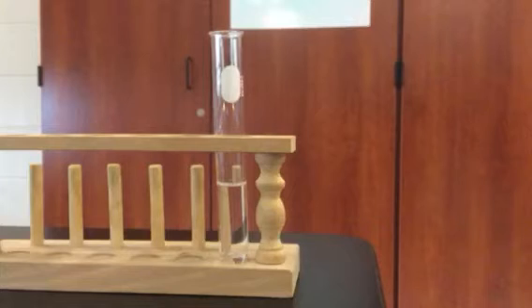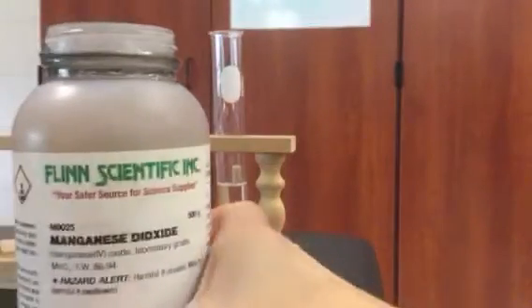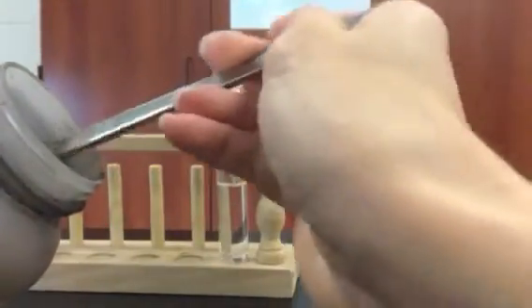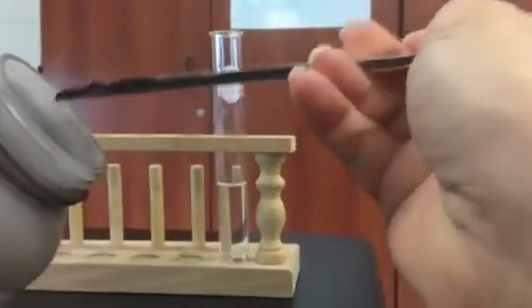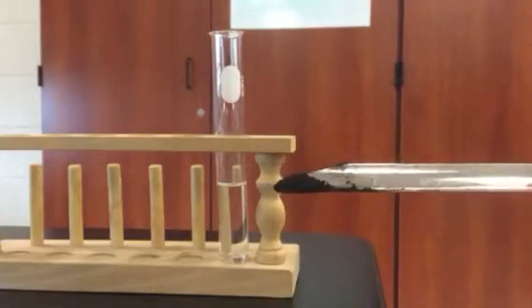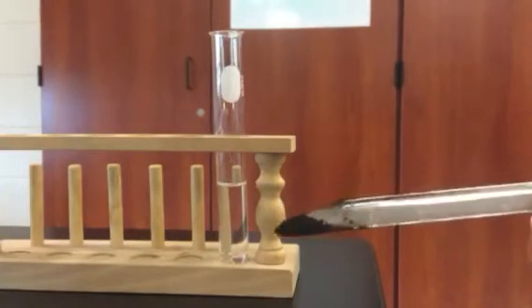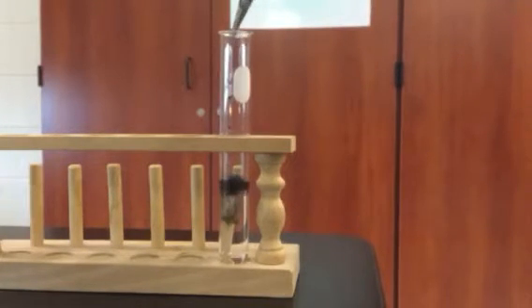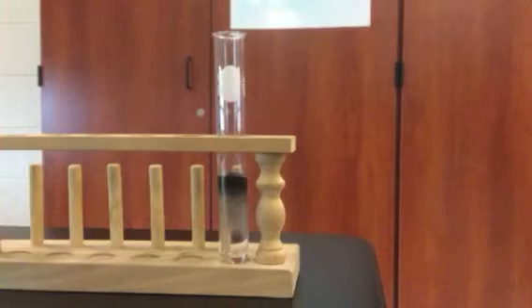And then we're going to add to that a little bit of manganese dioxide. That's our manganese dioxide — just need a little. It's a powder if you can't tell. And we are going to add it to our hydrogen peroxide.